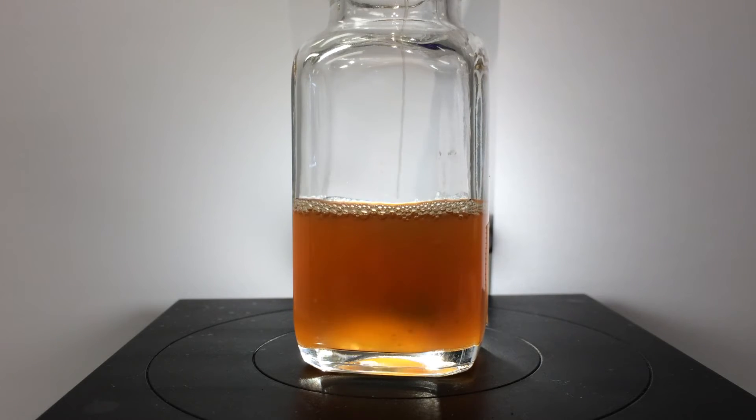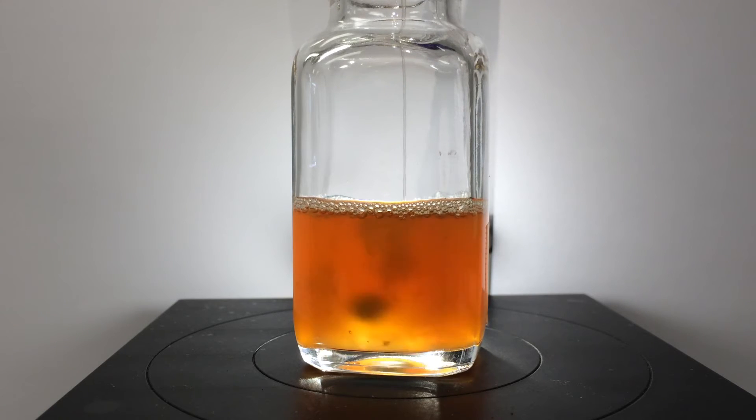We are going to add 2.5% diacid 1550 to this system under agitation, and you will see as we slowly add the diacid and it is going into solution that the system starts to clarify.